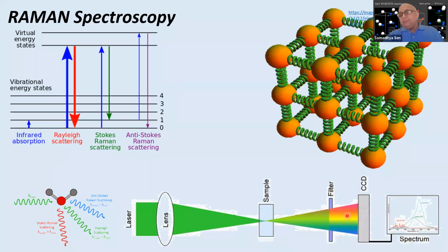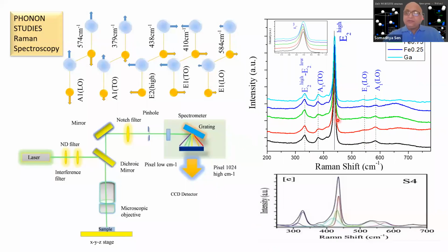And then we disperse the remainder of the light, and we get the Raman. Now, this is a typical Raman spectra, and you can see all the modes that I described here. And then we can deconvolute this Raman spectra into different specific Raman modes, which can allow us to understand which mode is more intense and which mode is less.